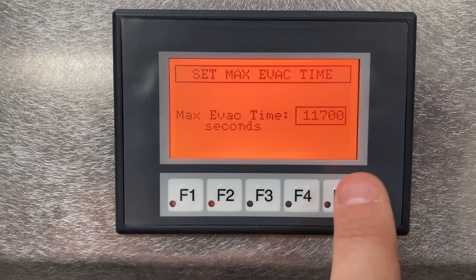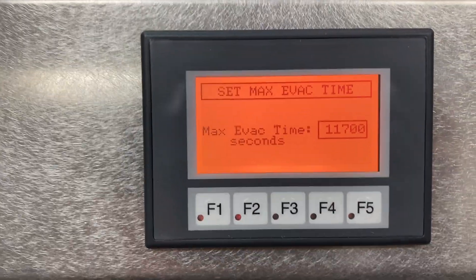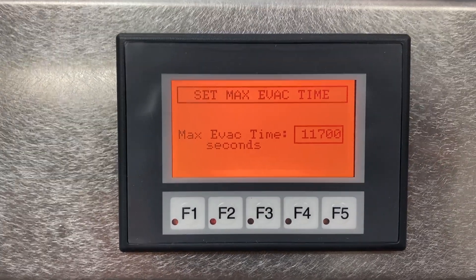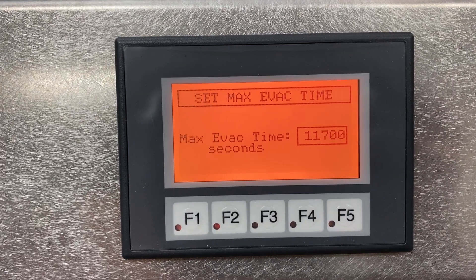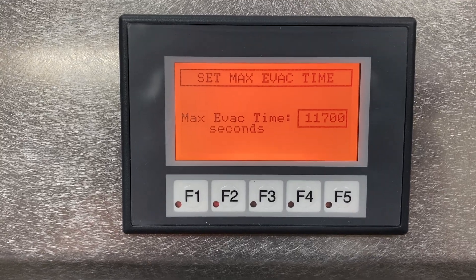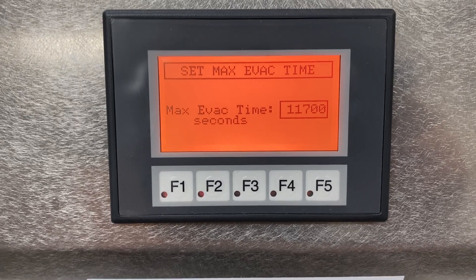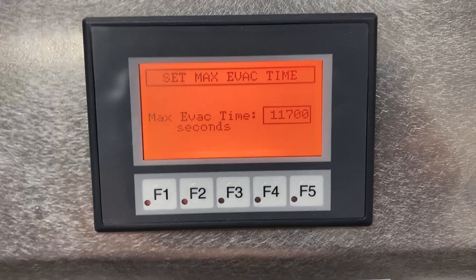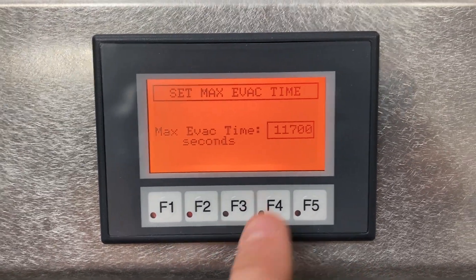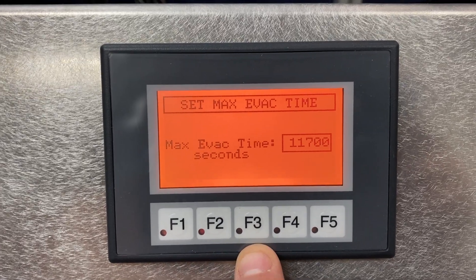The next screen shows the maximum evacuation time, in seconds. If there is a leak in the system or someone leaves the manual venting valve open, the system will only evacuate for this set number of seconds and then turn off. This is a safety feature in case the system is started but never reaches the target vacuum — it protects the pump by stopping the cycle. We usually have it set at about 11,000 seconds, which is roughly three and a half to four hours.